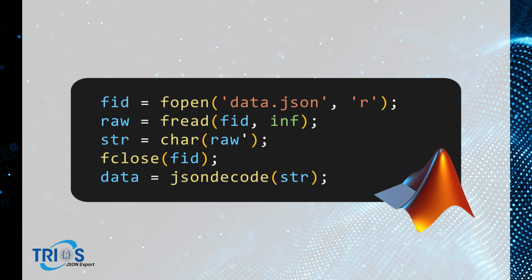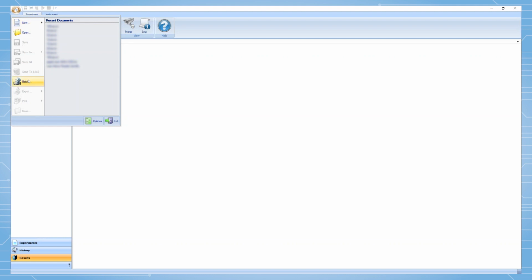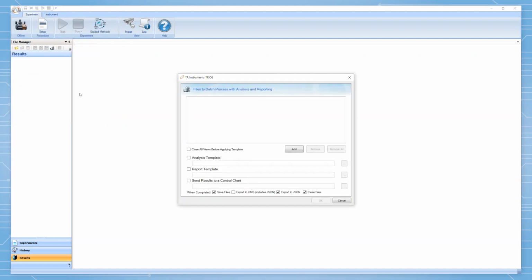Not only can you read these files easily, we guarantee a specific structure as defined in our open source JSON schema, so you can write your data ingestion code with confidence that it won't break when encountering an unknown part of the file. Now let's dive into the open source Python library, TA Data Kit, and see how it'll help you go beyond the simple archival of data.